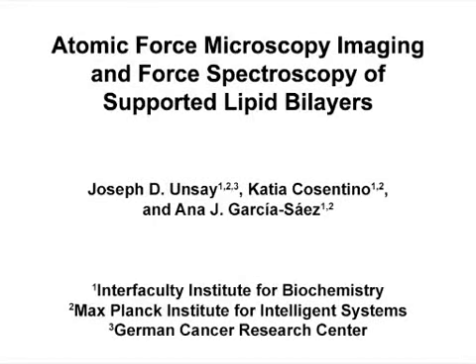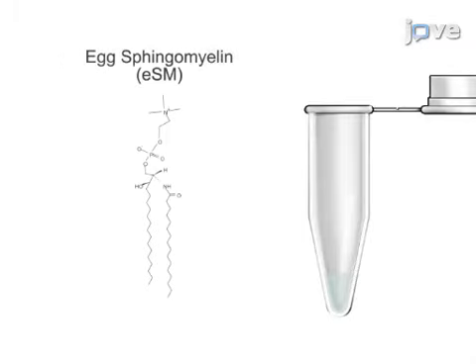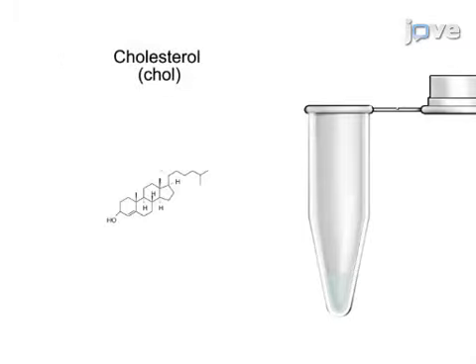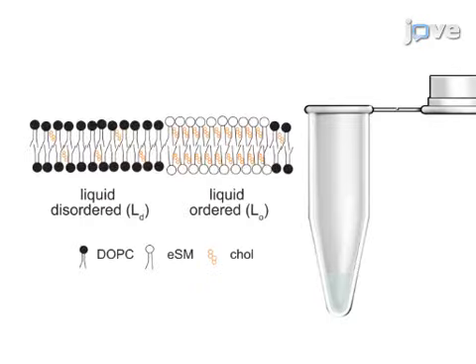The overall goal of the following experiment is to image and probe the physical properties of phase-separating membranes using atomic force microscopy. This is achieved by first mixing dioleoyl-phosphatidylcholine, sphingomyelin, and cholesterol at a 2:2:1 ratio to form a phase-separating lipid mixture.